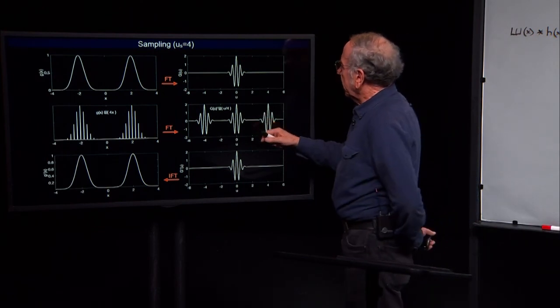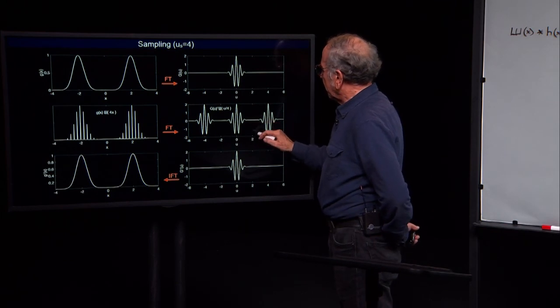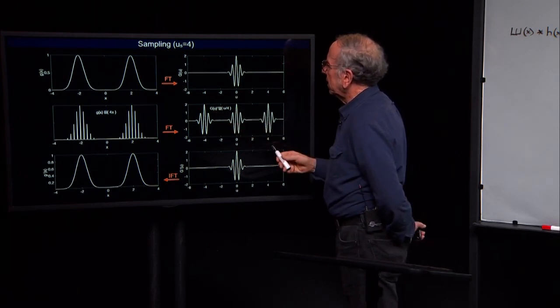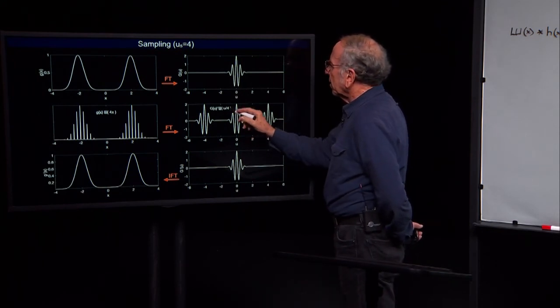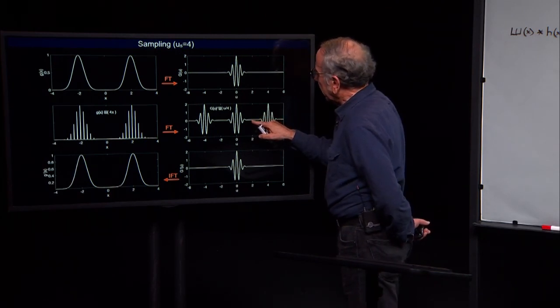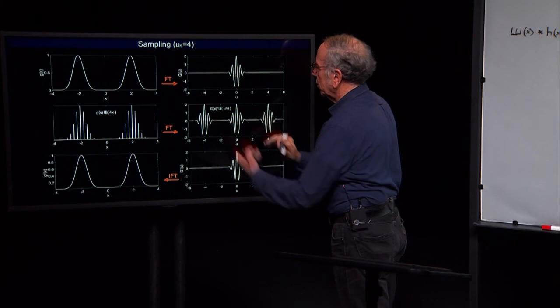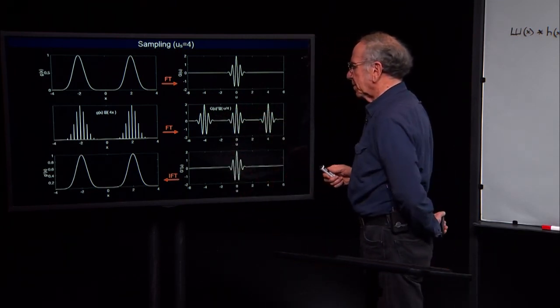I can do that if I know that this function is indeed 0 at the points halfway between the copies. That is, if I assume that g of u convolved with the Shah function at a periodicity of 4 has no frequency components outside of this limited range, then I can just force the value to be 0 outside of this limited range.